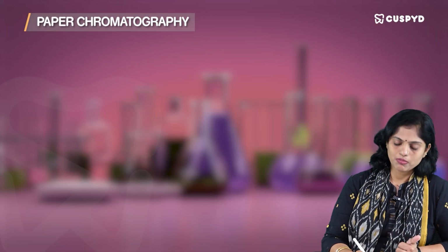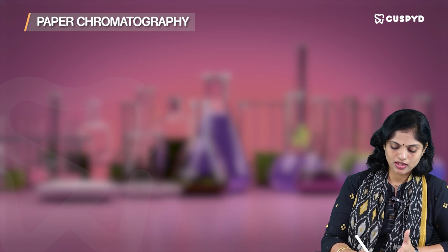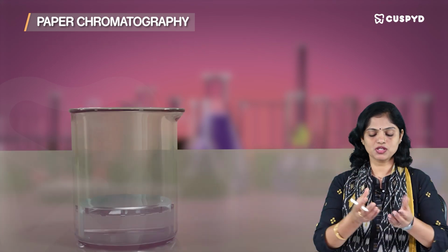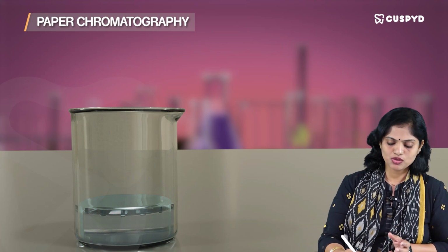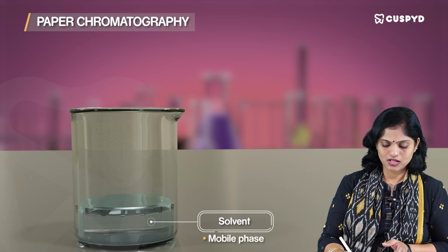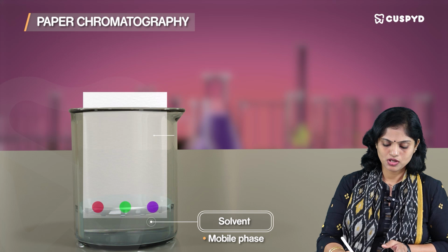Paper chromatography again can be done in two dimensions, single or two, and the force that is used here is called capillary force. So you have an apparatus where you just take a small beaker, or you have an electrophoresis chamber, where again you will have a solvent system. The solvent system is the mobile phase, and then the sample is moved, that is your solute.